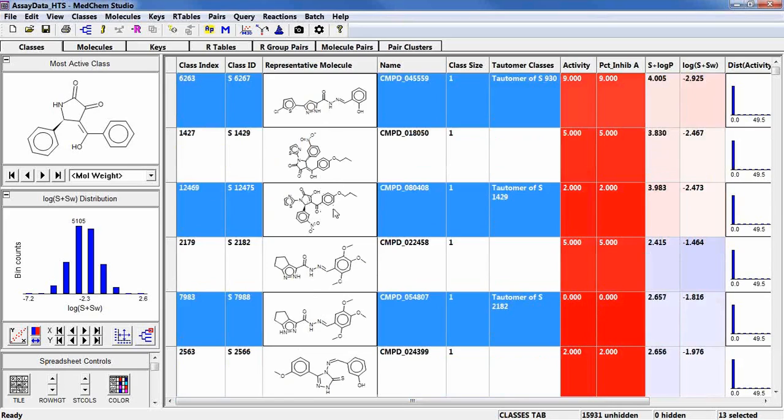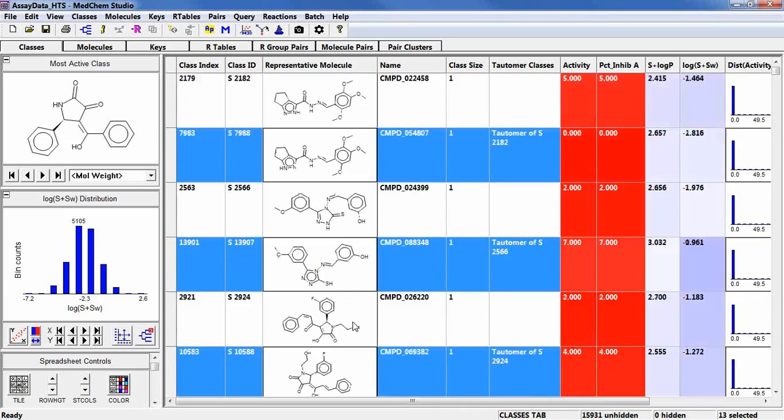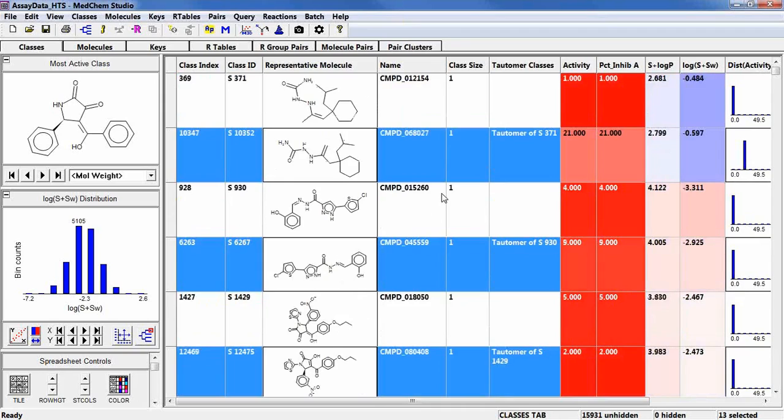Similarly, for these two molecules, this double bond's been moved down into the ring and then flipped up into the carbonyl, so that the hydrogen goes from the OH here in this chain over to the hydrogen on the amide or lactam ring in this case. Some of the other ones are going to be similar to these compounds. For right now, I'm just going to ignore these tautomer duplicates.